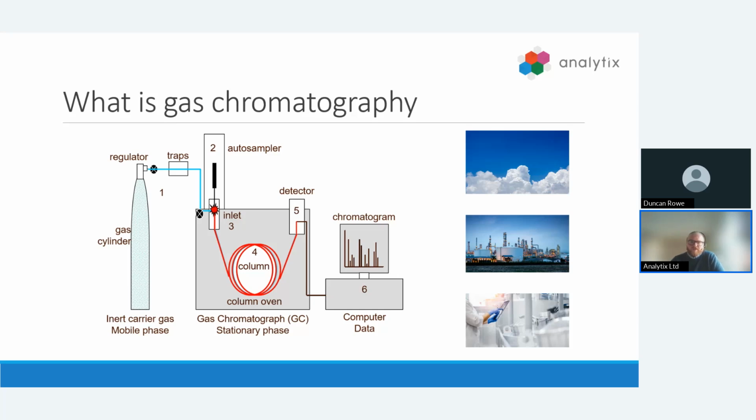So what I've done here is cover a general overview of gas chromatography as a technique, and what we refer to as benchtops. The Agilent Micro GC is based on the same principle of separation and detection as the benchtop GC, but shrunken down onto a much smaller scale. This is a dedicated gas analyzer. While I'll make comparisons to benchtop GCs, it's not a direct replacement for benchtop. Both have their specific strengths, and we'll explore the Micro GCs in more detail today.